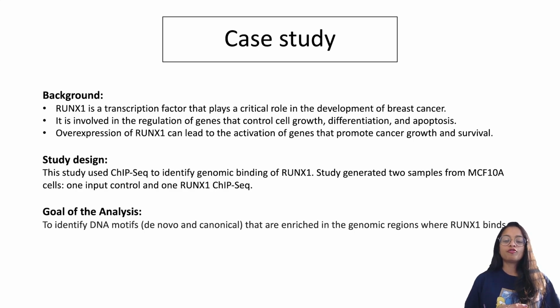So for today's demonstration, the data that we are going to use is a ChIP-Seq dataset, and there are essentially two samples that are generated from MCF10A cells. One is an input control, and one contains the regions where RUNX1 binds. MCF10A cells are essentially derived from non-tumorigenic epithelial cells, and these cells are often used as a model to study normal mammary gland development, as well as various aspects of breast cancer progression and cell biology.